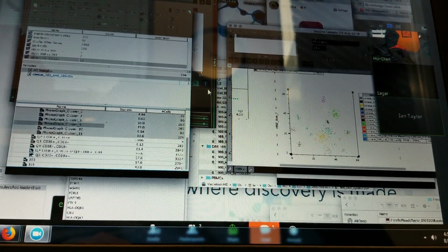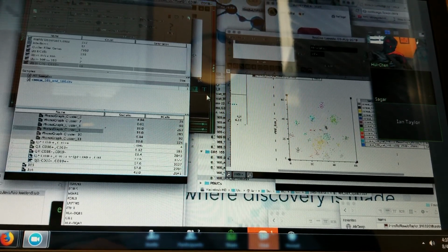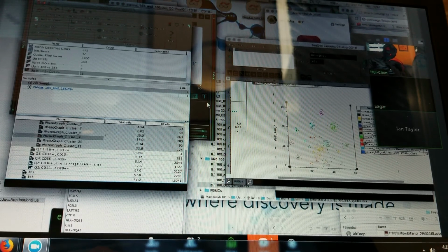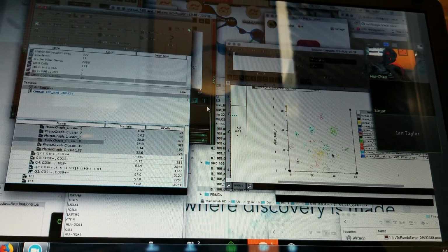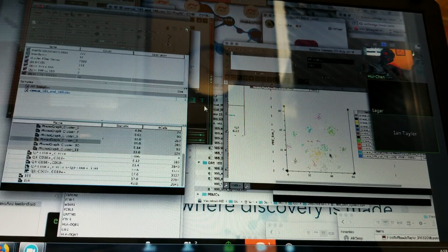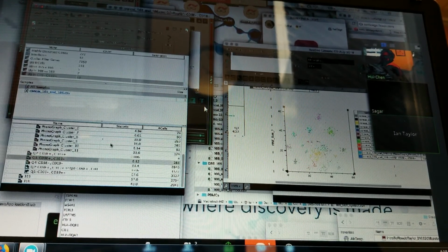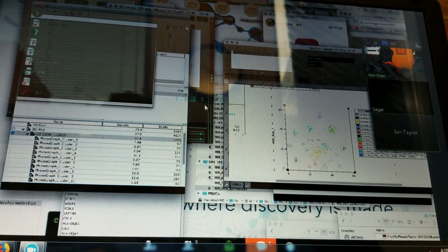Yeah, so at this point, we can begin to dig into these clusters and ask those kinds of questions, like what are these clusters? In this case, these are clusters within what we think are B cells. So these are probably B cells doing different things. Could be plasma, memory, naive, different kinds of plasma cells. We have to explore further to get into that. But just this gets us to the point where we can start to ask questions about the VDJ.